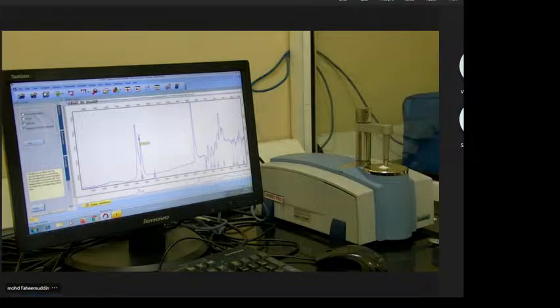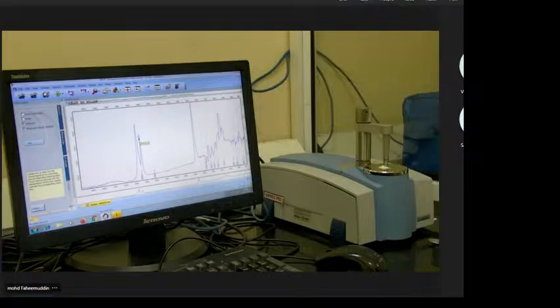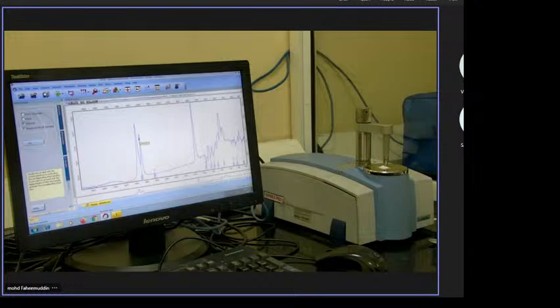Are you understand? Okay. So like this, we can test all synthetic molecules and all formulations. You want to determine what kind of functional groups a sample contains, for example, what kind of alkylates and other functional groups. That also we can do by FTIR analysis.